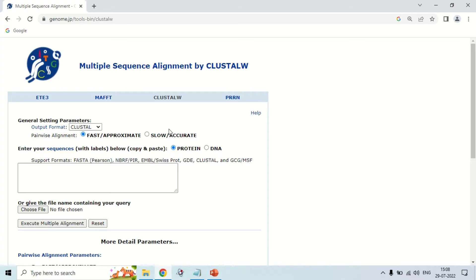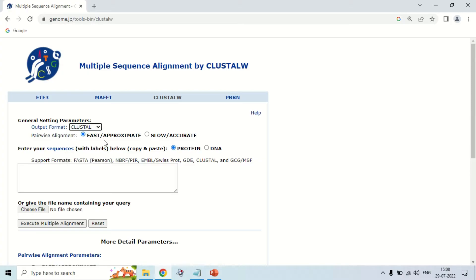Now there are options. The first option is the output format — this is the format in which you want your results. You can see many output formats, but we are choosing Cluster. Next is the alignment, either fast or approximate, and slow or accurate. I am going to choose slow and accurate. It is slow, but it gives the most appropriate results.